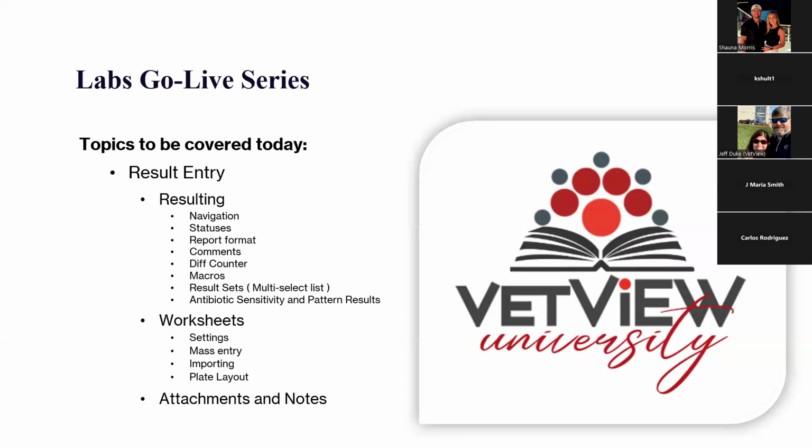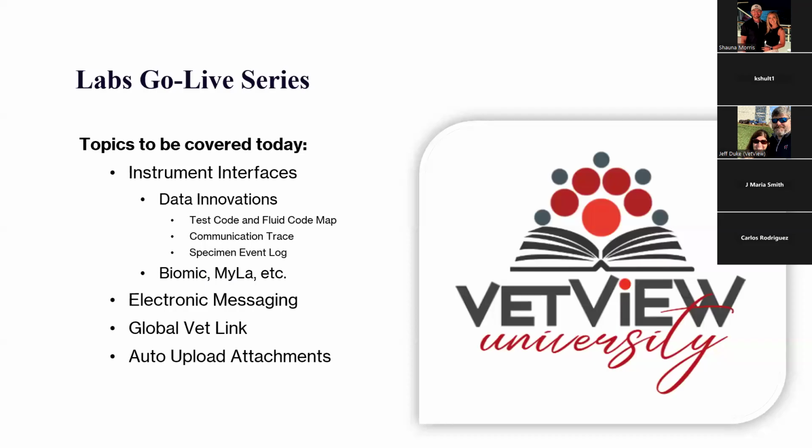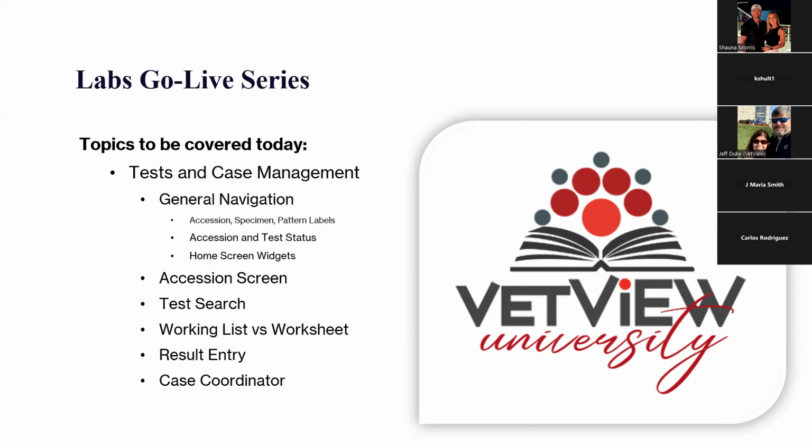And then the final session we'll have is on instrument interfacing, electronic messaging, and an overall look at how messaging works. A little bit with Global Vet Link as an example of an incoming source of data, as well as auto uploading stuff. So we'll have the three sessions today focusing around actually resulting out tests and the management of cases in the system. So we'll start with general navigation.